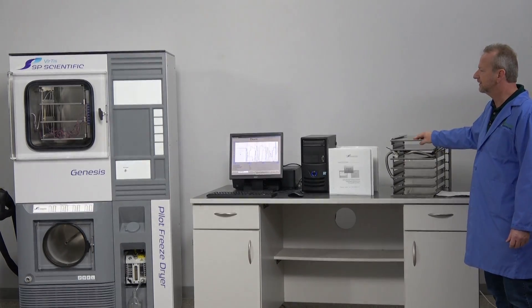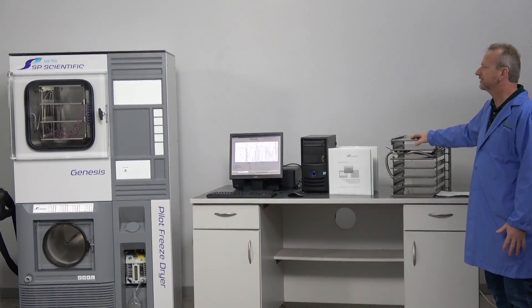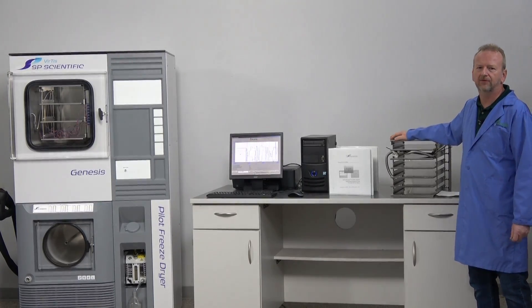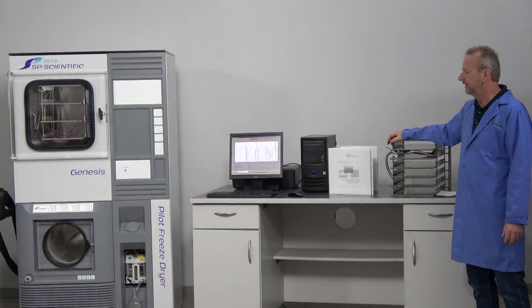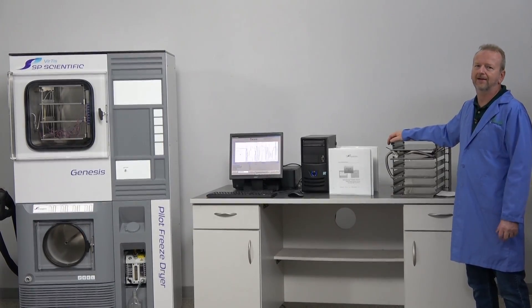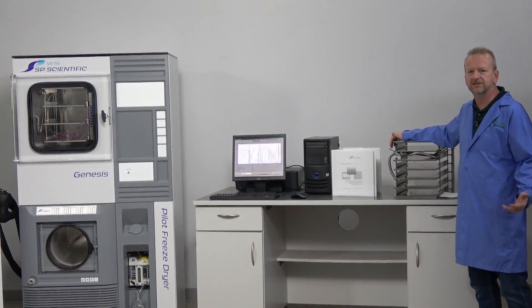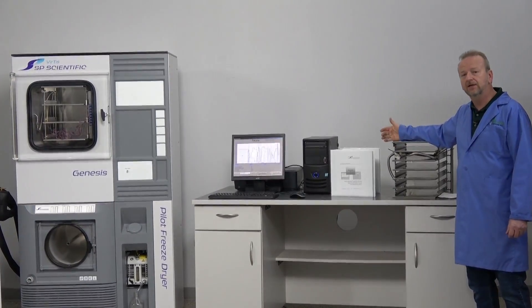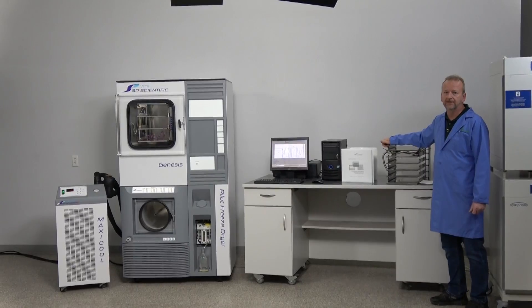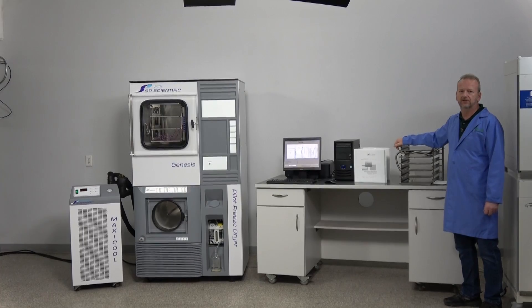This is one of the nicest SP Scientific Genesis machines we've ever had in terms of low hours. We were amazed it sat so little used, but they did have SP Scientific come in every year for calibrations regardless. So this machine is still under calibration from SP Scientific clear through April of 2023 — it's ready to go turnkey with the calibration stickers on it.